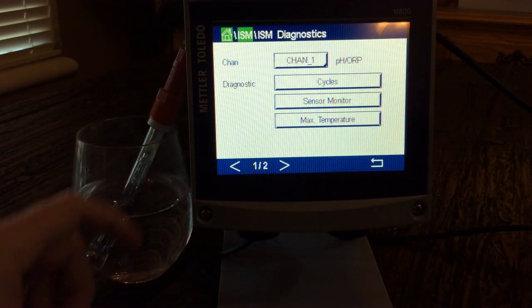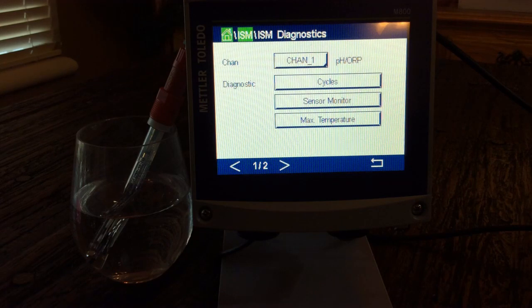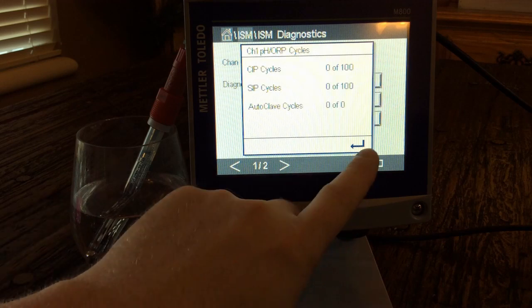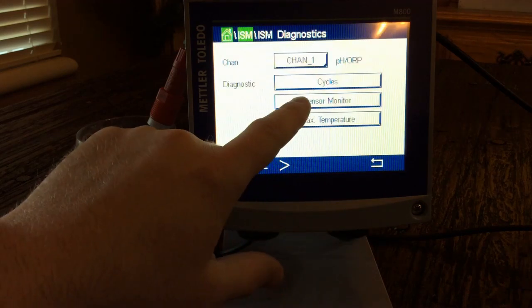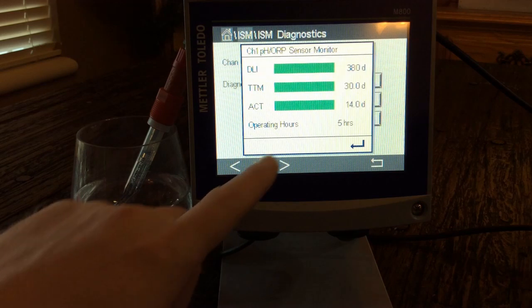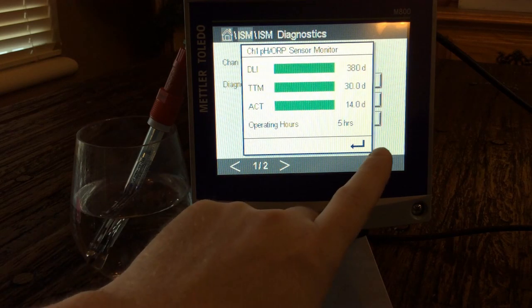Under ISM Diagnostics, we have multiple channels — I only have one hooked up so I can only see one. Cycles shows how many cycles the sensor has gone through if you're in a cleaning or steaming environment. You can also monitor the sensor's Dynamic Lifetime Indicator, Maintenance Timer, and Calibration Timer, as well as operation hours to see how long it has been running.